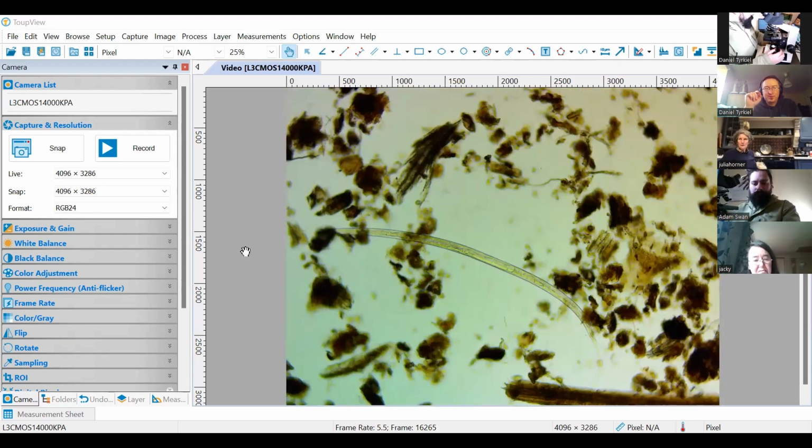And so if you are tasked with being scientific about your soil or compost, then you have to do more than one drop from one sample and then have an average of these nematodes. Normally, we don't do it. It's not really something that is required, especially if you're just doing quick assessments of your samples.